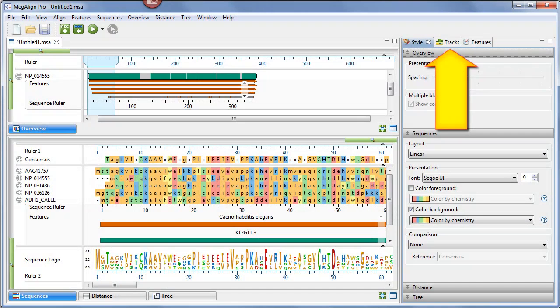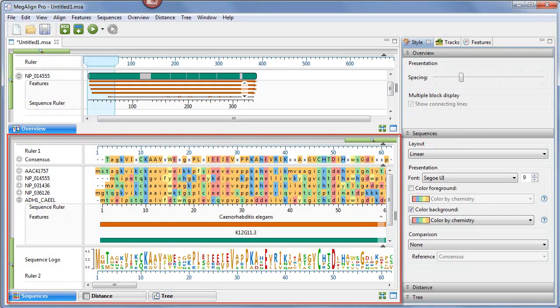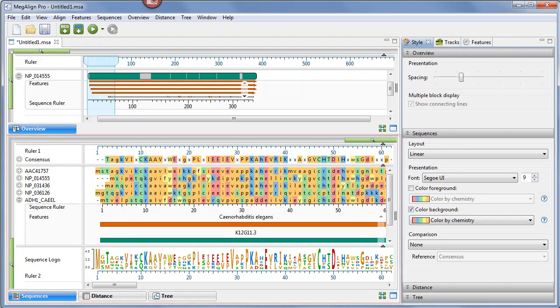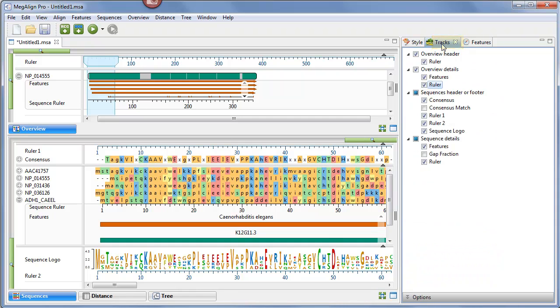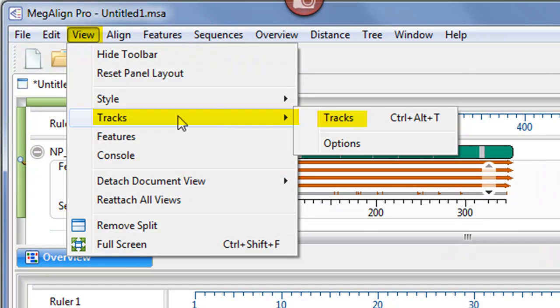The Tracks panel lets you specify which tracks to display in the Overview and Sequences view. The Tracks panel can be opened by clicking on the Tracks tab, or by using the View Tracks Tracks command.